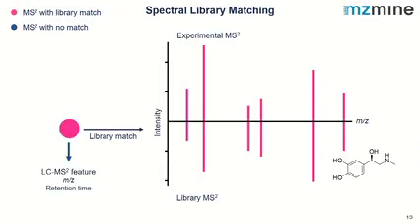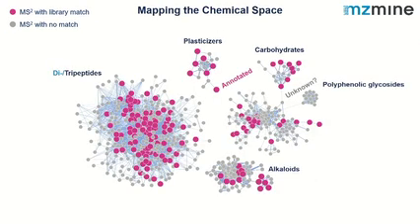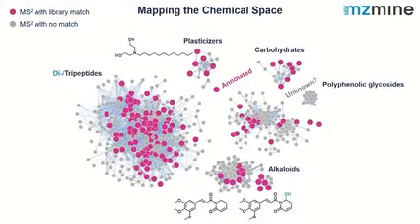With spectral library matching, we really just go for the exact matches, right? If we now have an analog of one compound, say with a methyl group, and we fragment both compounds, either we lose the modification and generate the same fragments, or, of course, we have the same neutral losses. This is what the modification-aware cosine similarity connects. If we do this, we end up with those networks. Some of them look very cluttered, like here. But if we zoom in, some of those nodes are annotated by spectral library matching, and we can propagate those annotations from one node to another node.